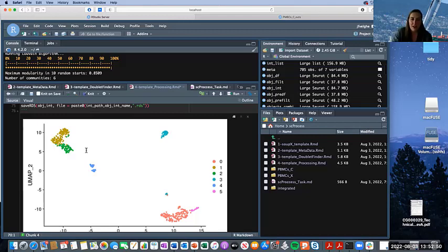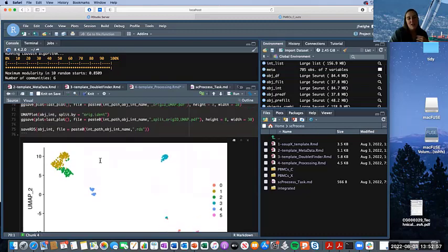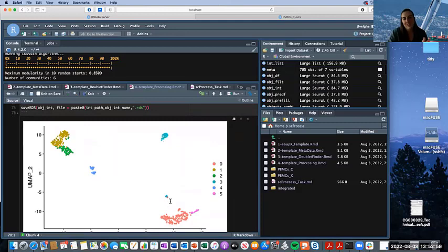And so based on that, these cells also get colored and put into different clusters categorically that are going to be showing how similar they are. Apparently between this big guy here and this little one here, these are technically the same cluster. However, on the UMAP, they are a little bit of a distance apart. So I would kind of question whether that actually is the same cell, but for you guys, you probably have this one showing up potentially as its own color, cell colored cluster, which would be more accurate.